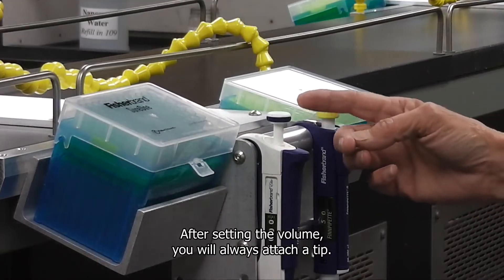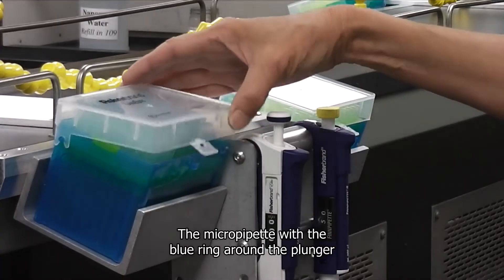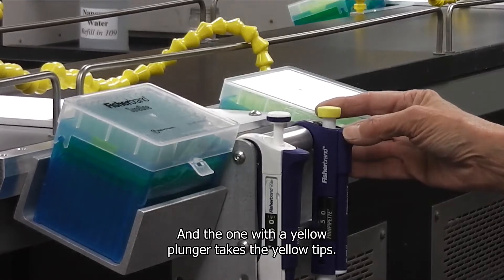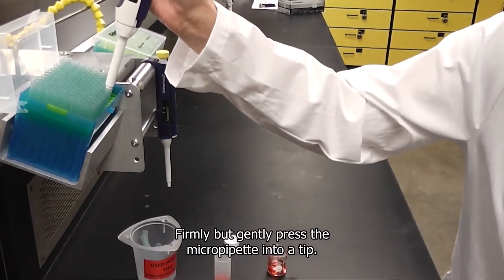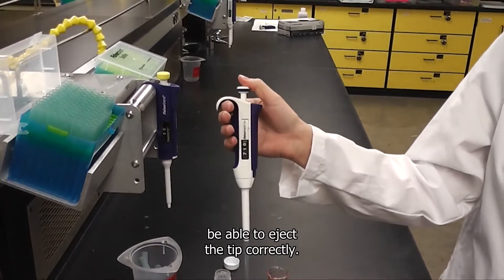After setting the volume you will always attach a tip. The micropipet with the blue ring around the plunger fits the blue tips, and the one with the yellow plunger takes the yellow tips. Firmly but gently press the micropipet into a tip. If you press too hard you may not be able to eject the tip correctly.